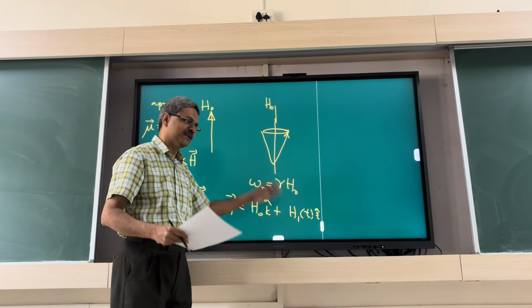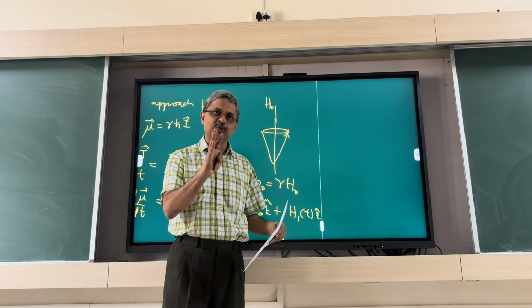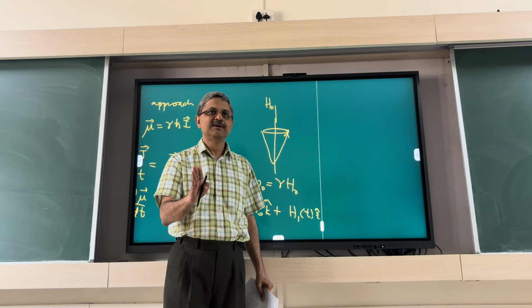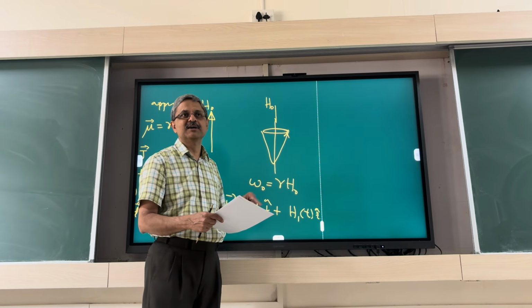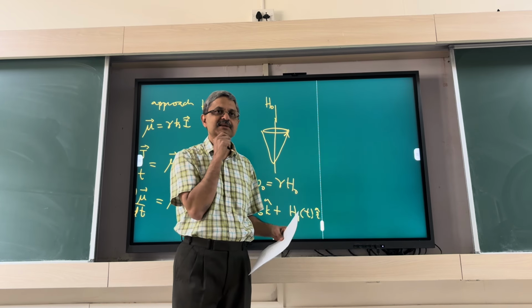So what is the condition of resonance? We already learnt on that. I should have my H1 field to have a sin omega t type of term with that omega equal to this omega. Then I'm matching the energy level difference by my external agency.